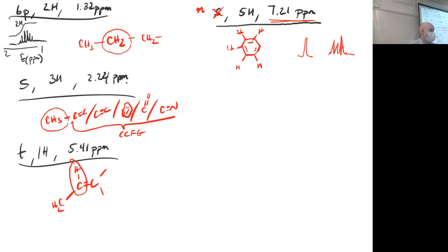So it's complicated, but since it doesn't matter, good news. You don't have to worry about it. This is part of why I would look at the chemical shift first. Again, if it's 5 or above, which it is here as well, then start there because that gives you a lot more information. You won't be slugging through to figure out other things.